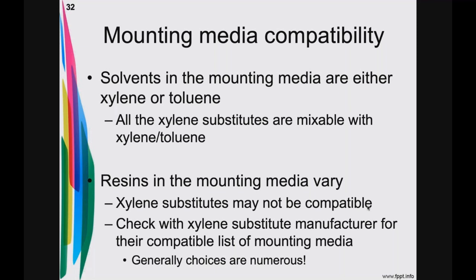What we have to be concerned about is the resin that's in that mounting media. The resins over the years have totally changed. We now have fast-drying mounting medias. Those have to do with the acrylic resins, versus the old days of the mounting medias that were quite yellow, the Permount. That was a pinene resin. And it's the resins that we need to make sure are totally soluble. Yes, they're soluble with the xylene substitute. When xylene substitutes first came out on the market in the mid-1980s, there was a limited number of mounting medias that you could use with them.